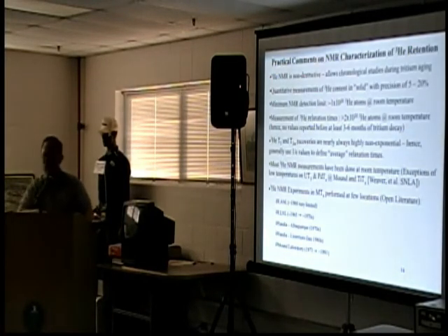All right. Having given you a little bit of what the NMR is, I'm going to talk about helium-3, and then we're going to talk about tritium. The reason that we follow through the helium-3 is that it's a non-destructive technique, so it allows us to do long studies of tritium aging effects in material. And we could do quantitative or semi-quantitative measurements of helium content in the different materials, so we could then compare that with data measured by destructive techniques, volumetric gas analysis, mass spec.